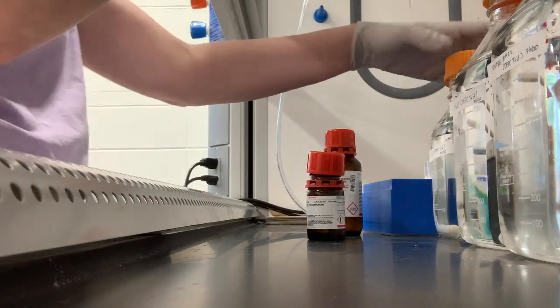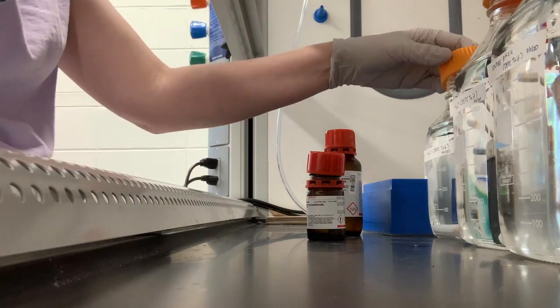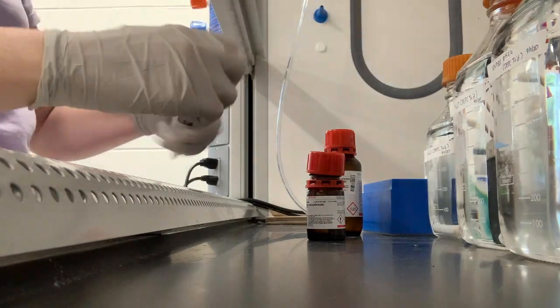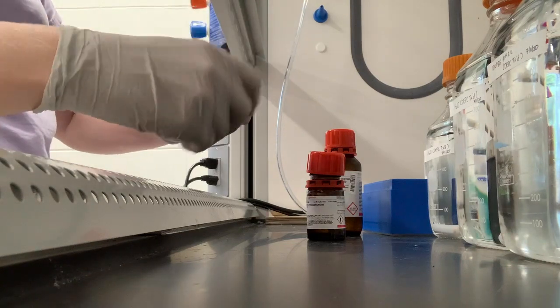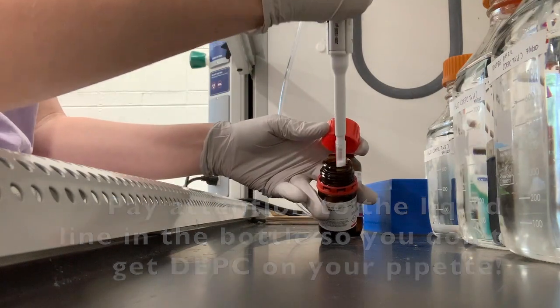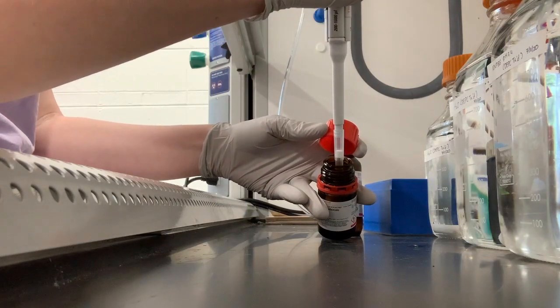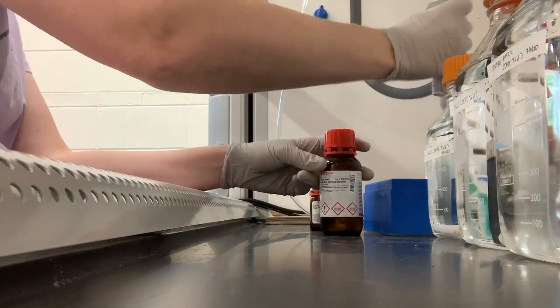And I've already loosened the lids to my bottles too, so that I can just pipette that into the solution. That was all that was in the smaller bottle.